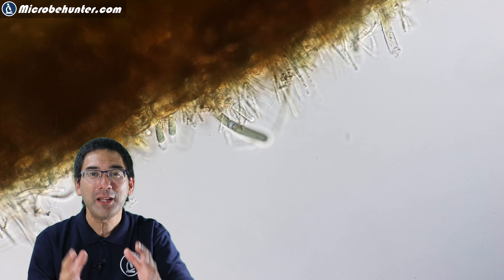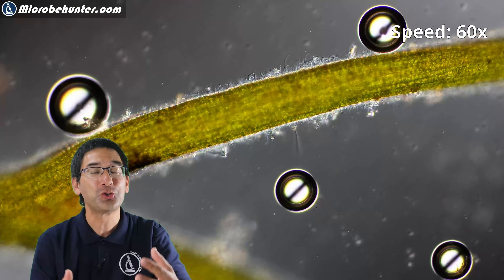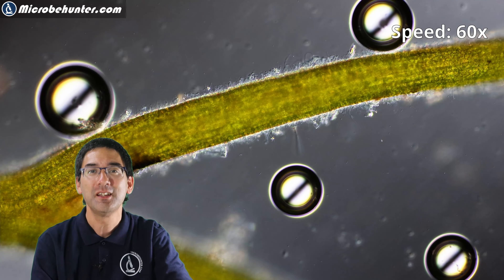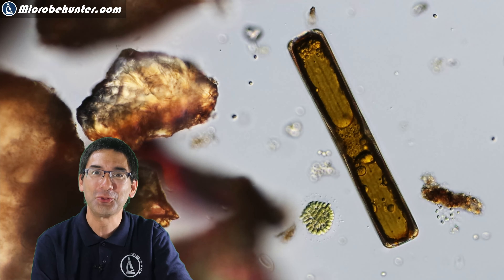Today I'm going to show you some microorganisms growing on the surface of a water plant, some fast-moving chloroplasts inside of plant cells, some growing oxygen bubbles due to photosynthesis — and they grow quite quickly — and last but not least, a lonely diatom. Plenty of stuff to show you today.